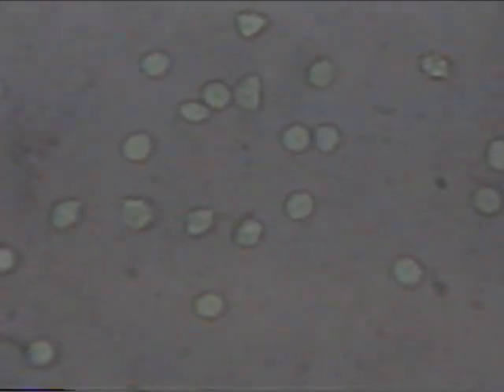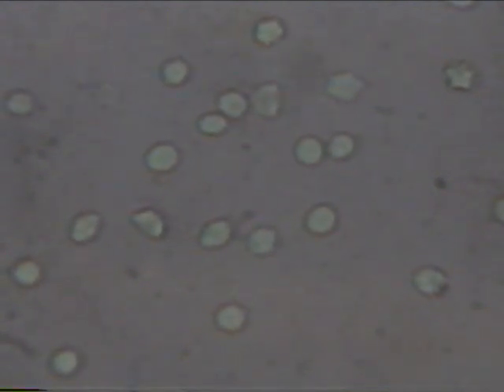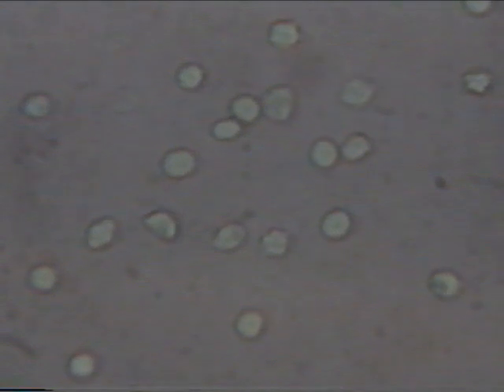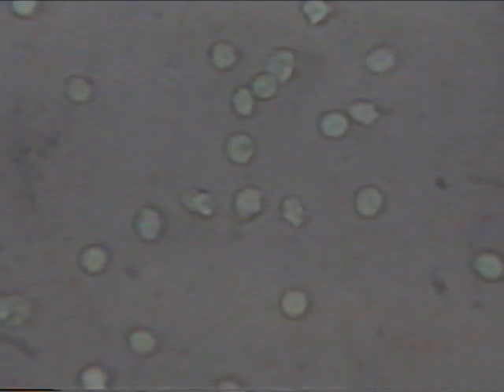Here you'll notice blood cells from my finger. There's a little movement going on here because the dye is evaporating. The water is still evaporating, so it's pulling these blood cells toward the side of the slide. You'll notice nice little round and some irregular shaped blood cells with a very well-defined edge. There they are, human blood cells.